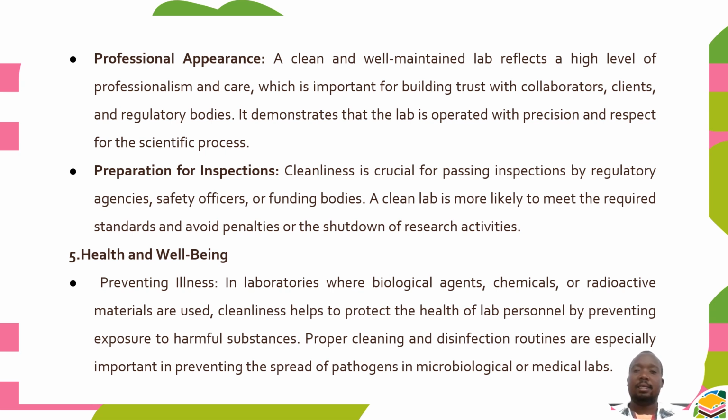And again, cleanliness ensures health and well-being. Yes, this is very important. Preventing illness in laboratories where biological agents, chemicals, or radioactive materials are used, cleanliness helps to protect the health of lab personnel by preventing exposure to harmful substances.